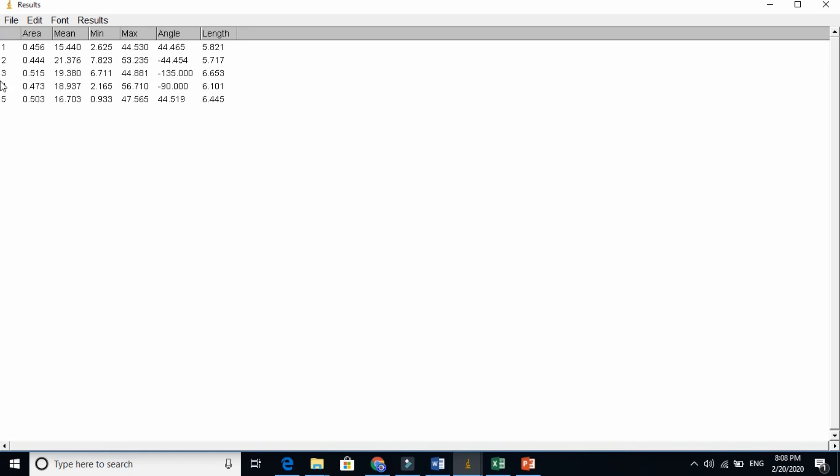And you will see that we took just 5 dimensions of that. You see, the lengths are here almost similar.